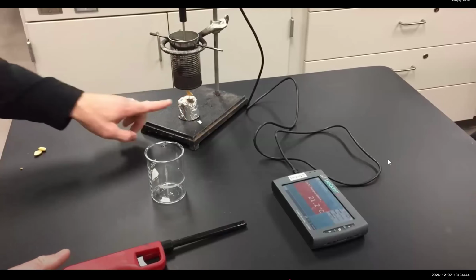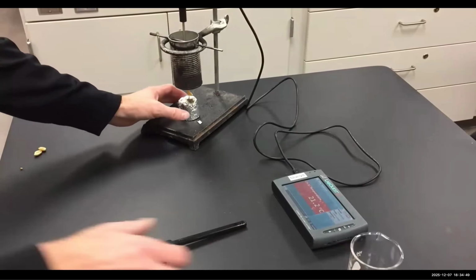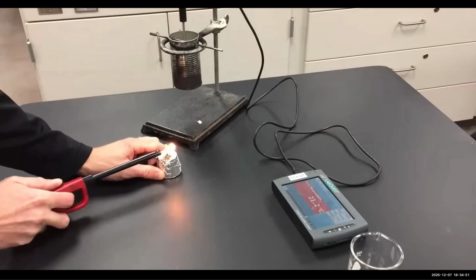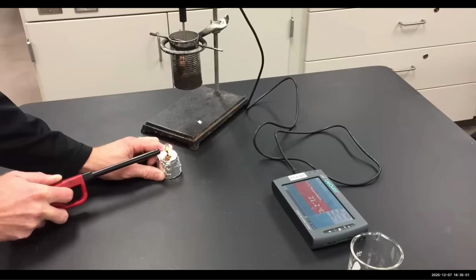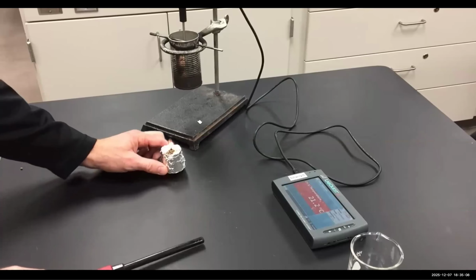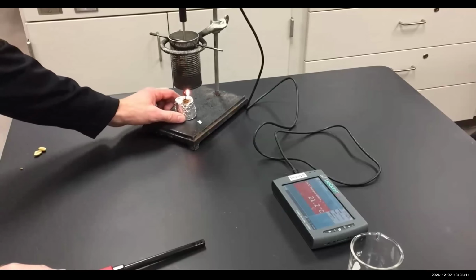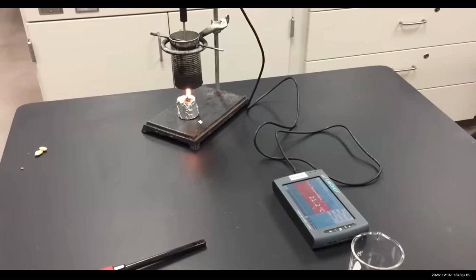So here we go. The food sample is placed under the calorimeter, and now we're going to burn that food sample. As the food sample is burned, it's going to be releasing heat into the surroundings as we're converting the various compounds found in the food sample into carbon dioxide, water, and other byproducts.